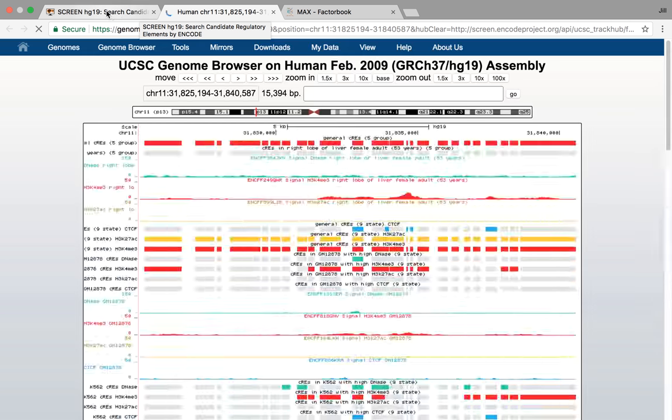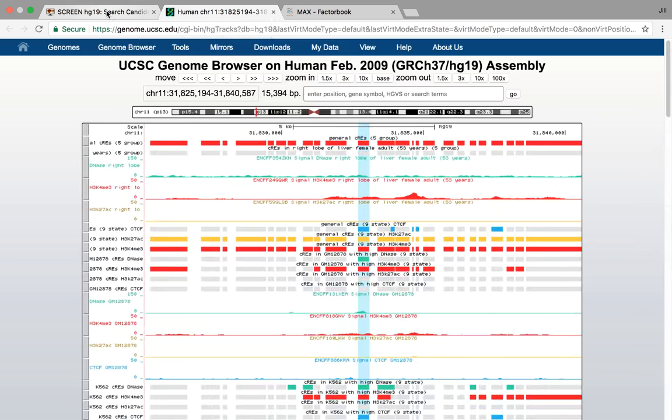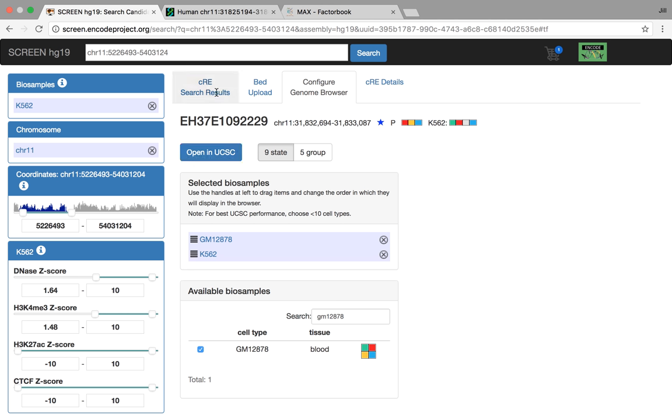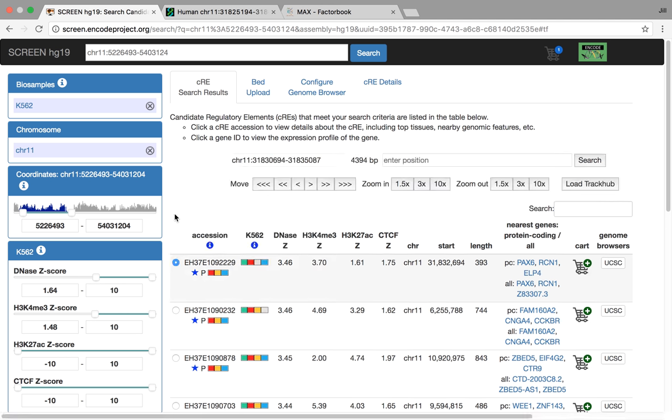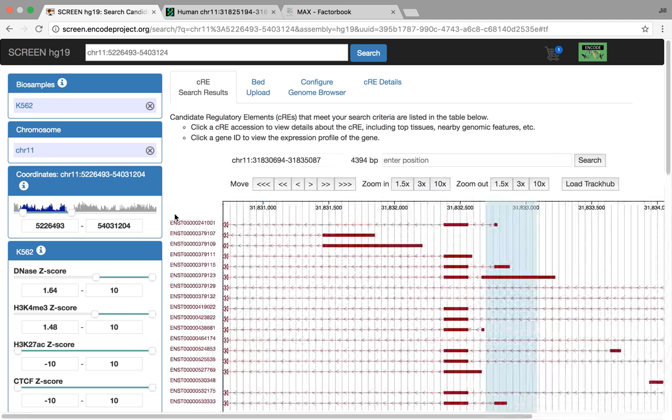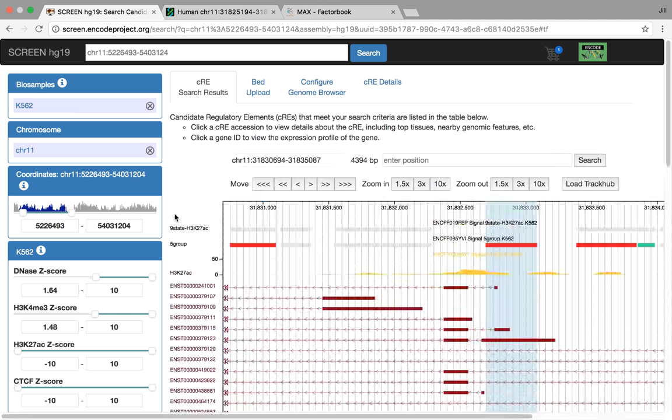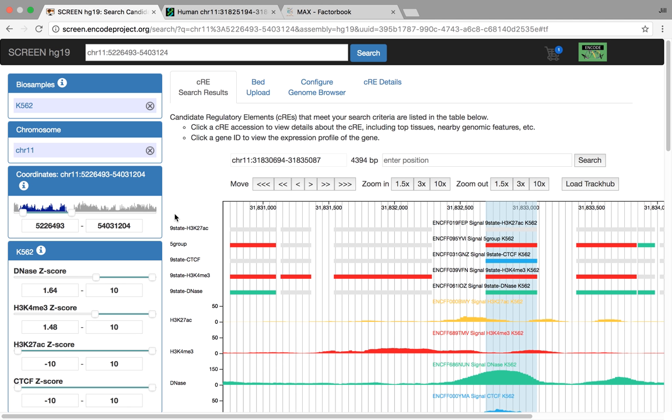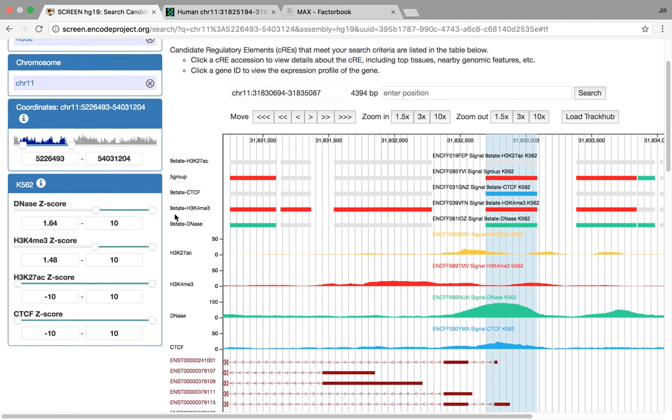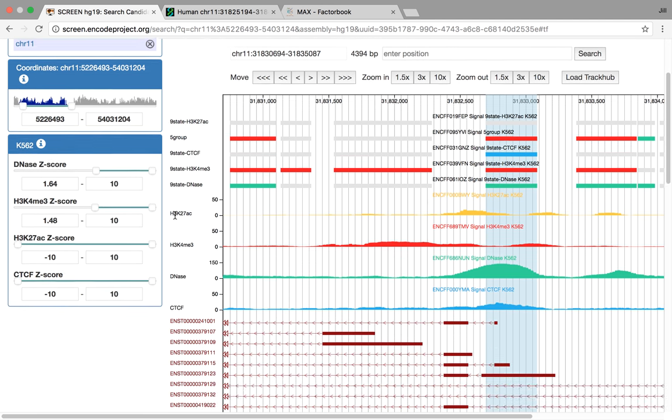Okay. This does take a little while though. So one of the newest things we've been working on, and this is still really in beta, is an integrated genome browser here. And this is still a little bit raw, but we are actually starting to become quite happy with how it's looking.